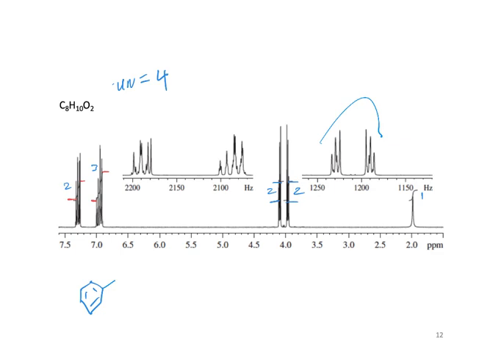Well, 4 is pretty far upfield for an alkene. Because usually, even if it's a terminal, the protons on the end of an alkene, they're usually like 4.7 or 8 or something. Okay, 4 for me more screams like next to an oxygen. Okay, and that would make sense.